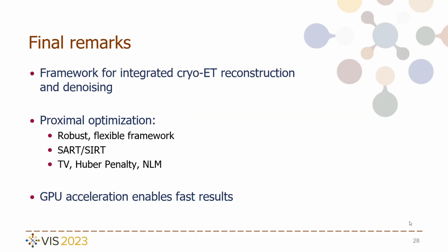In short, we presented an integrated reconstruction and denoising cryo-ET framework which is robust and flexible thanks to the power of proximal algorithms. The framework includes several reconstruction and denoising techniques, and GPU acceleration enables fast reconstruction times.